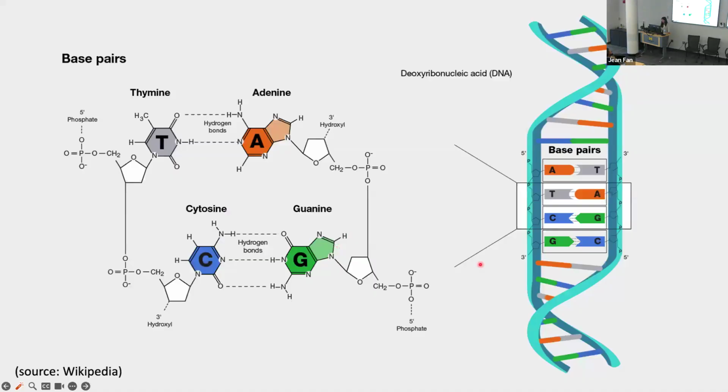So, okay, how do probes know what to bind? This is just some background for students in the audience who might be less familiar with the biochemistry. Remember, we have this wonderful complementarity system in our DNA where A pairs with T and C pairs with G. So when we design these oligonucleotide probes, they have a particular sequence that we design to be complementary to the target RNA of interest. Therefore, if we wanted to look for off-target binding, this essentially becomes an alignment problem.